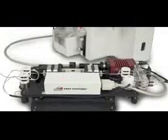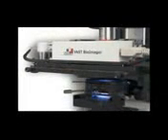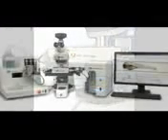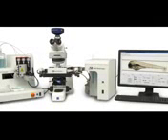VAST BioImager is a modular and expandable platform. The base VAST BioImager system allows for organ-level bright field imaging from its onboard camera. Available upgrade features allow for microscope mounting and communication with your upright microscope and camera, transforming your imaging platform into an automatic high-throughput, high-content imaging workstation.